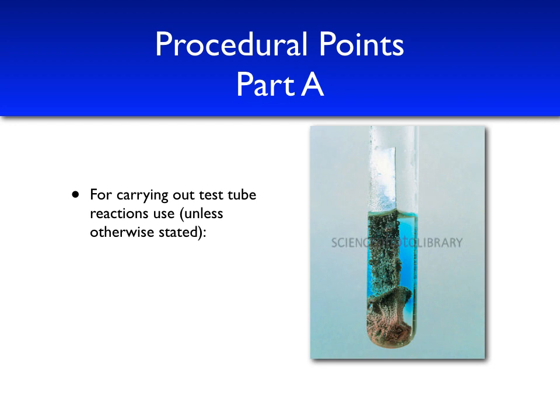Another thing you might note is that when I carried out the test tube reactions, I made sure to only use 1 to 2 milliliters of any solution. As I was saying, this is more of a qualitative experiment. We're not really interested in exact amounts, just using enough to observe the chemistry. You'll also notice that for many of the reactions where metals are needed, I only used 1 or 2 strips of the metal. This is important as well. For example, there'll be one reaction, I don't want to give it away, where it's a good thing I only used 2 turnings.